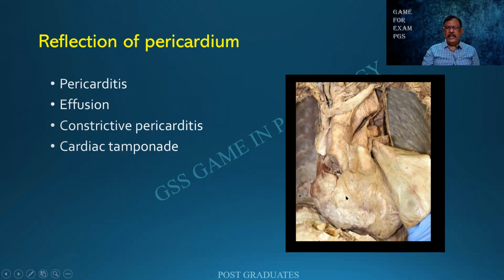Normally, you will be able to see the underlying structures through the pericardium, just like the pleura. But here, it is opaque, thanks to the pericarditis and fibrosis. There might be different types of effusions, a serous effusion, seropurulent, or a hemorrhagic effusion. Sometimes there can be what is called a constrictive pericarditis, and there can be a cardiac tamponade also. If you are lucky, we shall be seeing a couple of pictures of this. These I have removed from the dissection of the heart, a beautiful series if you people can lay your hands on.